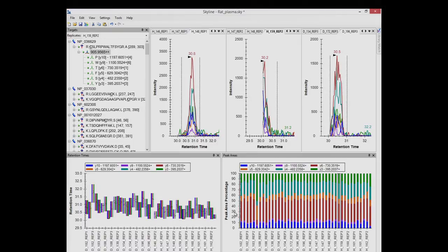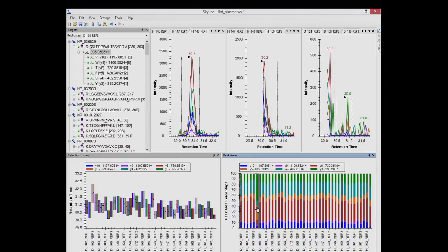Yeah, so there's this one replicate that has quite a lot of Y5, a lot more Y5 than everybody else, and a lot more Y3. So click on that one, and again, you can see a very teeny peak next to a truncated peak, and I'm going to say that we're just going to integrate the truncated peak as truncated by clicking beneath the x-axis and then dragging and releasing.